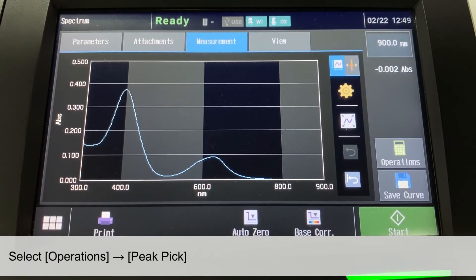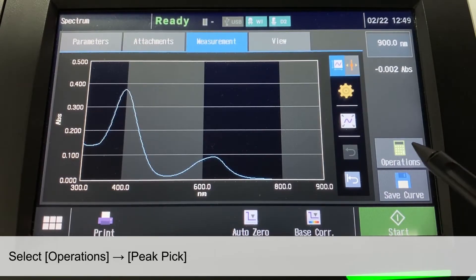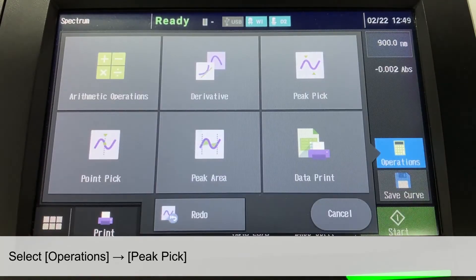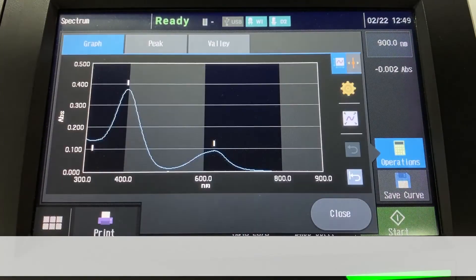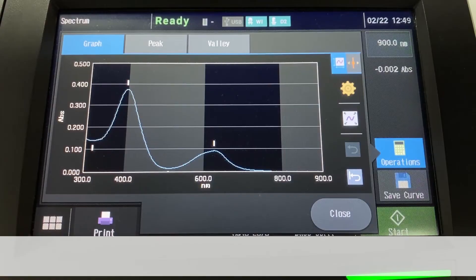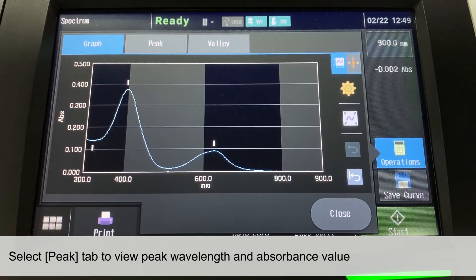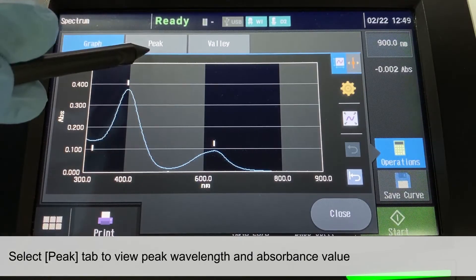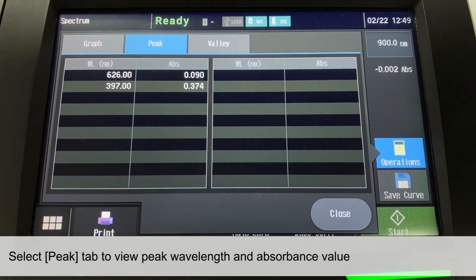To determine the absorbance peak wavelength, first select Operations, followed by Peak Pick. Peak detected would be displayed by the small white indicators. Select the Peak tab to check the peak's wavelength and the absorbance value.